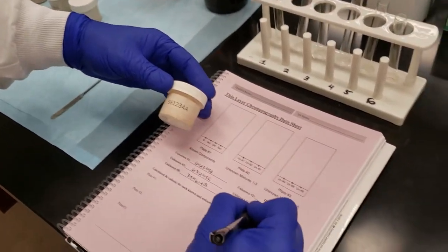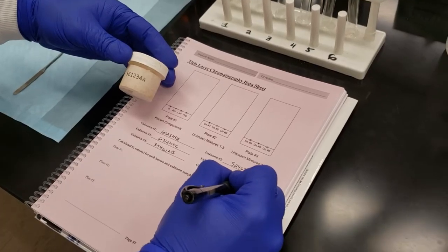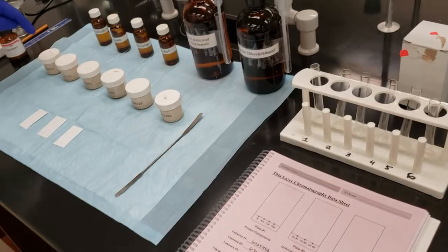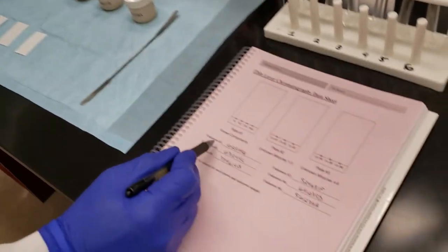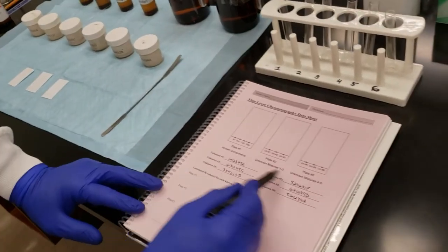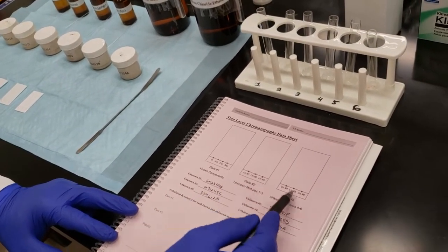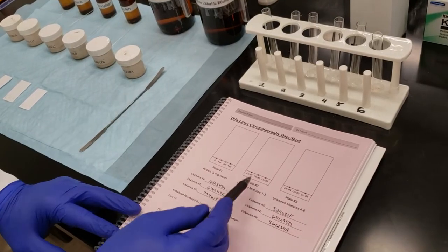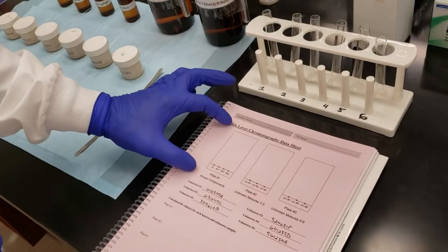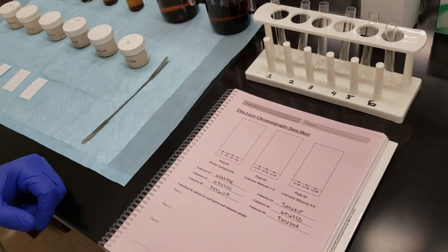So what I'm doing right now is making sure that I've written down all of my unknown codes corresponding to unknown number 1 to number 6. I just went left to right. And now I've got all these labeled out, and that's going to correspond to my TLC plates that I create in a little bit. And of course, my data sheet here, I'm going to be drawing in the developed TLC plates that I get after performing the experiment.